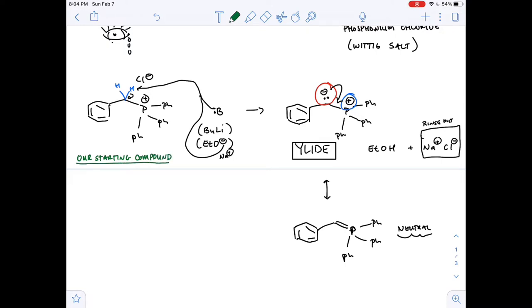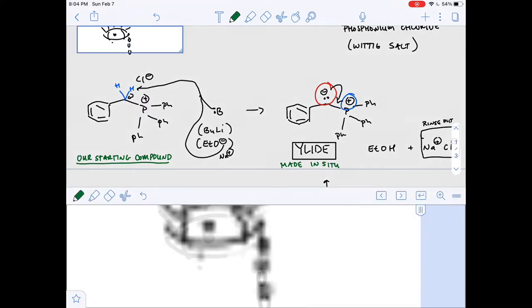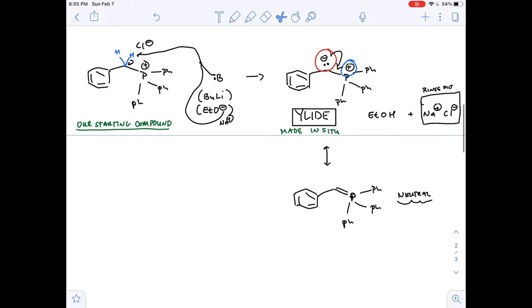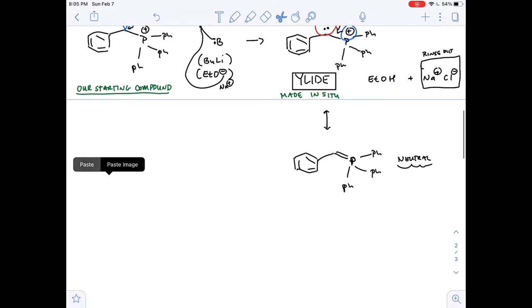And I do want to point out also that this is our starting compound, okay? So, sorry, I just sneezed and now I'm all congested. But the ylide is made what's called in situ, right? And so that's basically saying that we form this in the reaction flask and we don't isolate it, okay? It's made in situ and then it just reacts with our cinnamaldehyde in this case, okay?